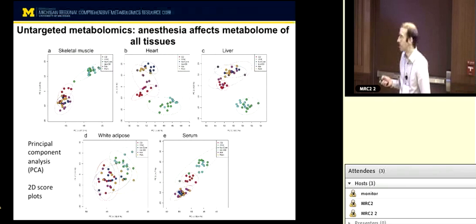In general, when you have enough of it, a dry tissue mass or a protein assay give somewhat comparable results. If you have smaller quantities, the protein assay can be a little bit more reliable than a weight. The analytical method that we used, you've heard a little bit about this already, was a HILIC approach performed on an aminopropyl stationary phase. It's very good for polar metabolites, and works for some non-polars. The polar metabolites, those things associated with central carbon metabolism, tend to be the most affected, the most rapidly changing metabolites in tissues a lot of the time, so we wanted a method that was compatible with looking at that.